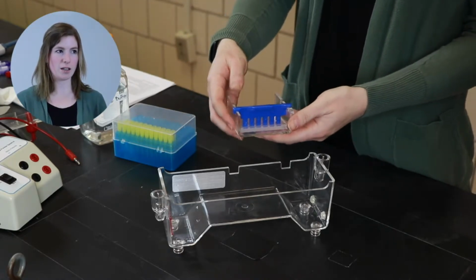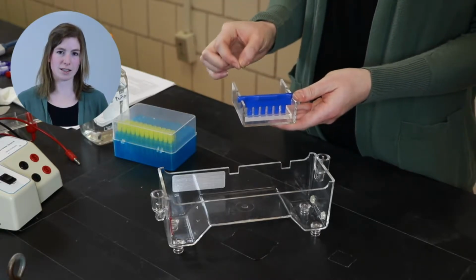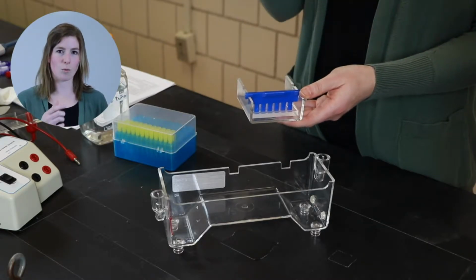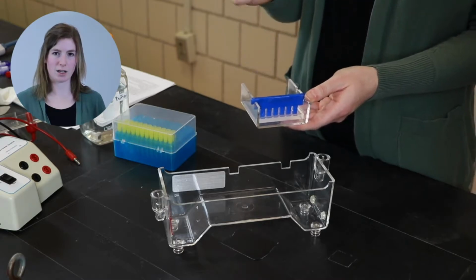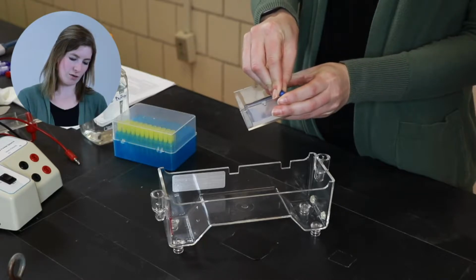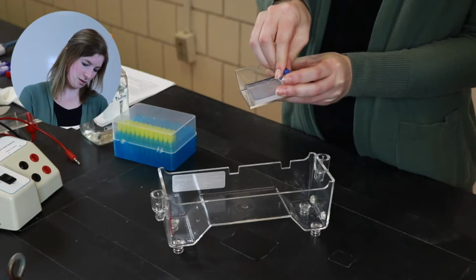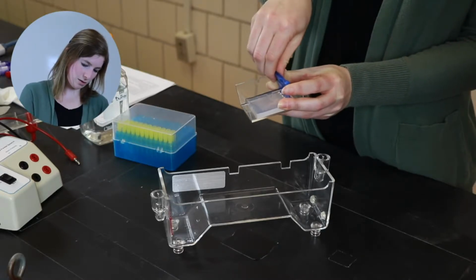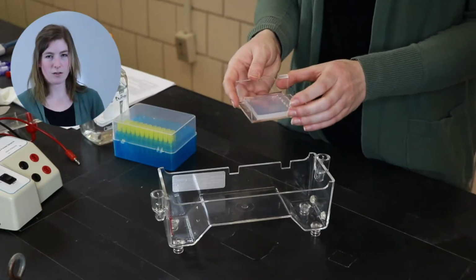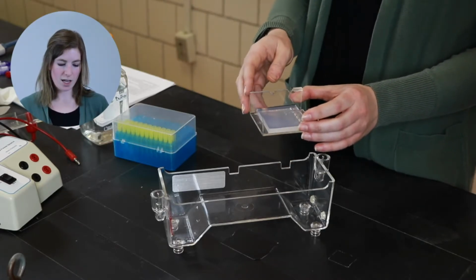And then this blue thing here is called the comb, and it actually makes the little wells inside the gel. So it goes into the gel just a tiny little bit to create a well that I can then put my liquid samples into. Again, I'm going to be careful taking these out because I don't want to rip the wells at all. All right. Now that I have that out, I'm ready to put this into the box that will eventually run my samples.